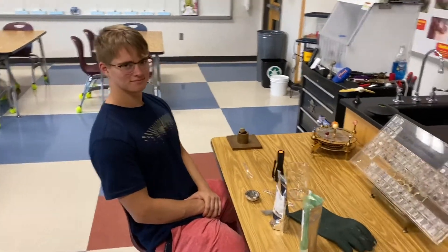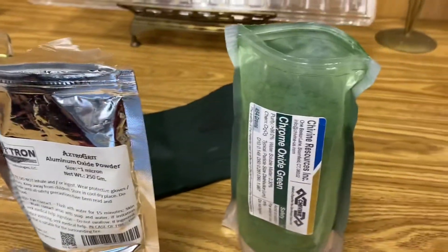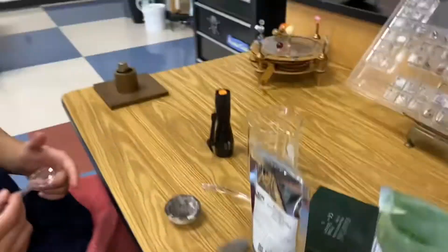Okay, I'm here with Alex. All you need to make your rubies is equal amounts of aluminum oxide and chromium oxide in your crucible, and he's going to mix those together right now.